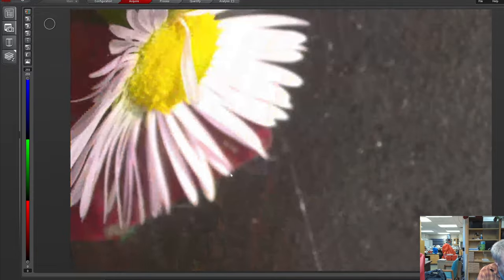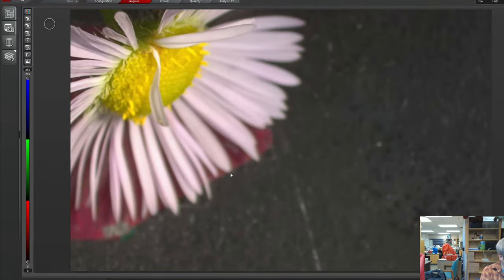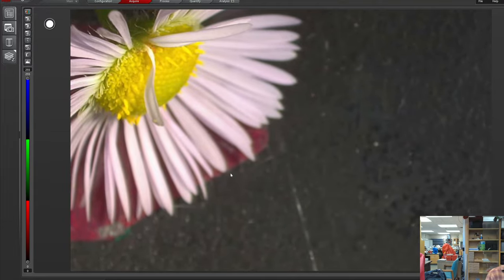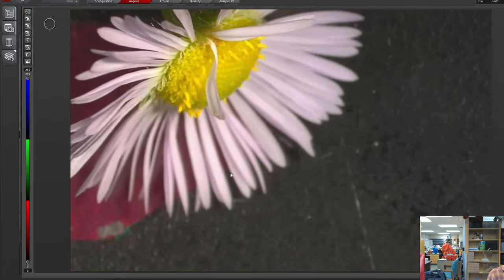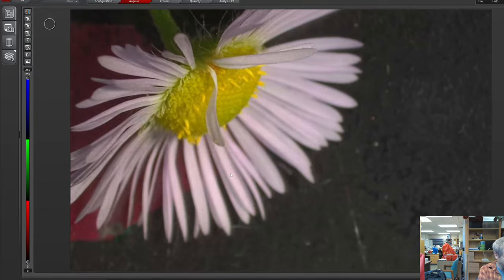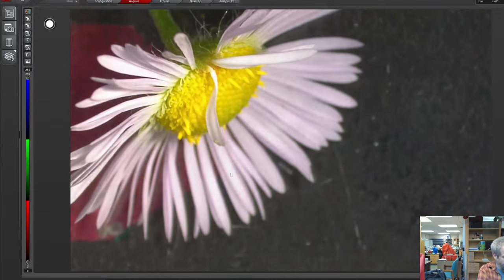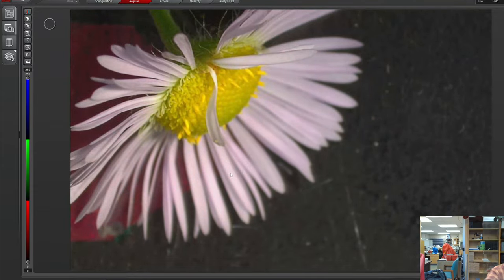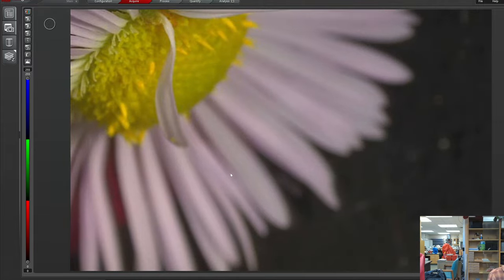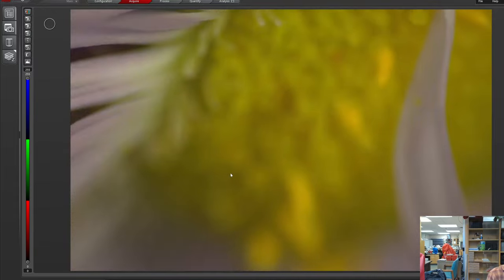This is a little daisy. We've also looked at this on the scanning electron microscope before. Not this individual, but the same type of little pink and yellow daisy. And it looks brighter and less pink with the lights on it, but you can see a bit of the natural color there. And again, if we zoom in, I think the center parts of flowers are always way more complicated than they appear.